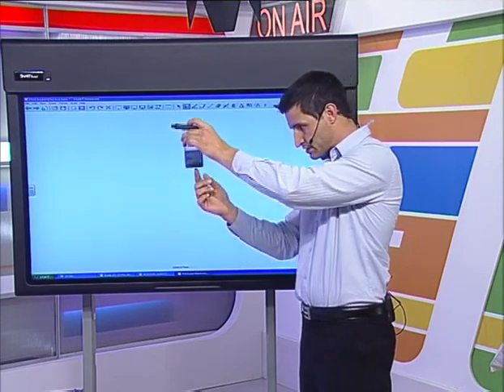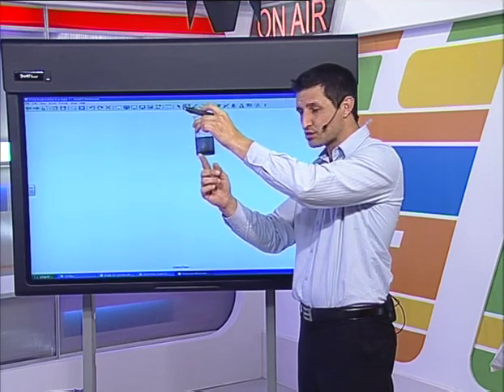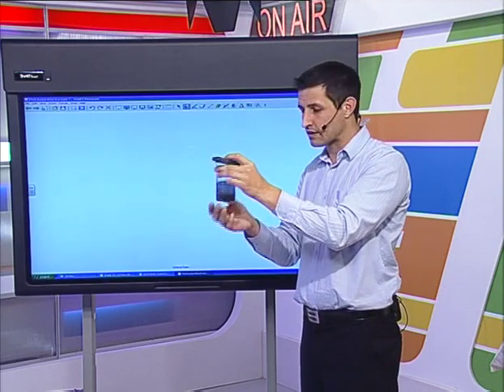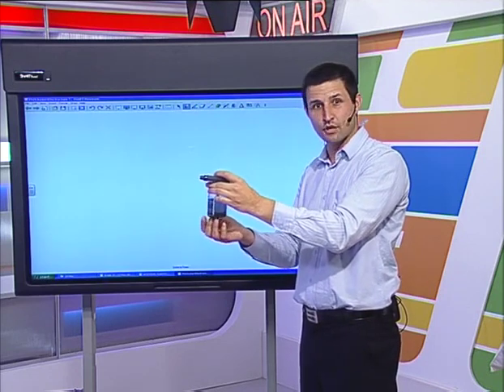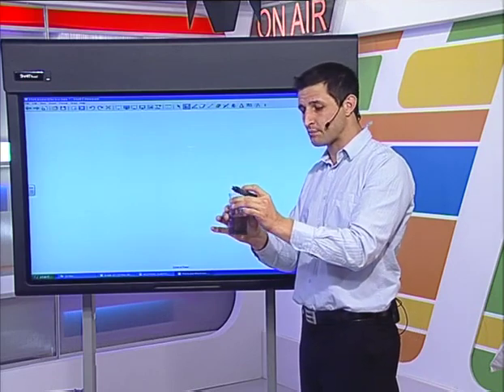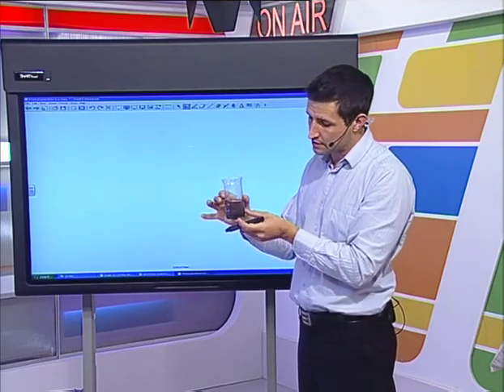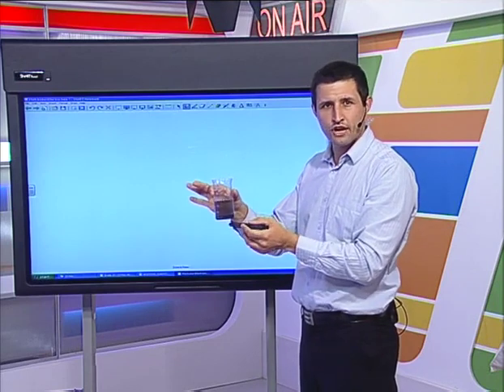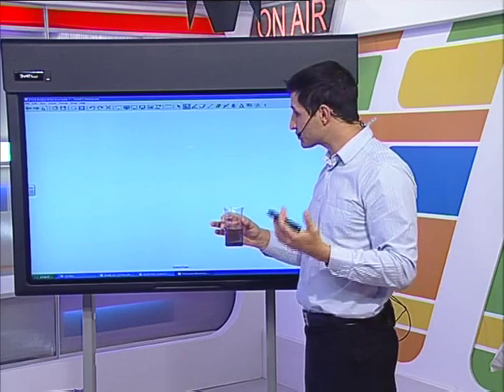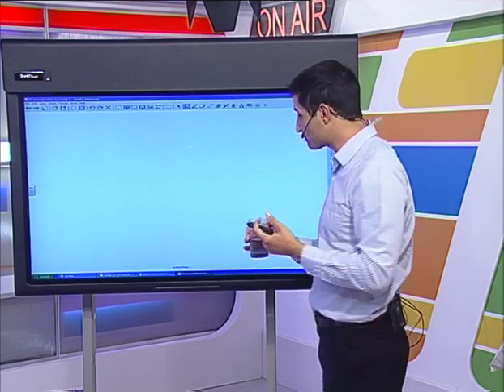And what I actually notice at the bottom here is a mixture of the gray, which was there already, but there's something brown inside there. There's a brown material sitting at the bottom here, and that is copper metal. So I'm going to try and explain what happened here. This was definitely spontaneous. I threw in this gray powder. The blue color vanished, it disappeared, it went away. Now let's try to figure out how to work with this in terms of redox.